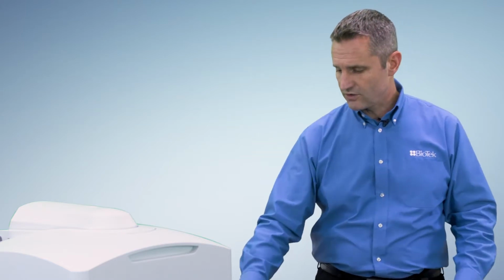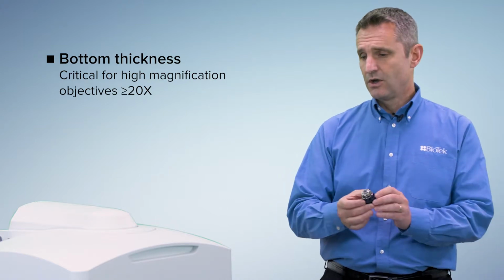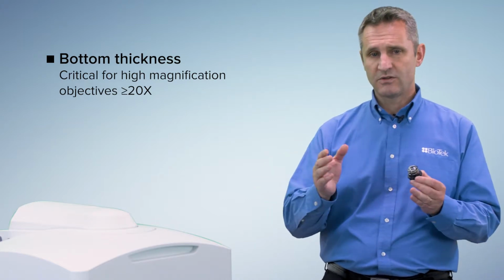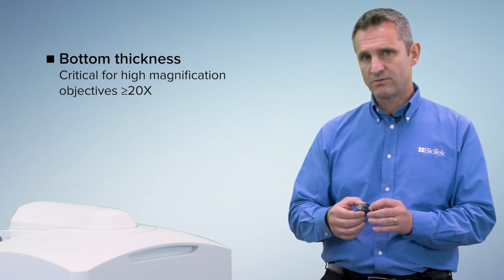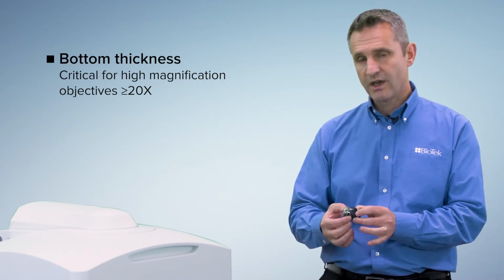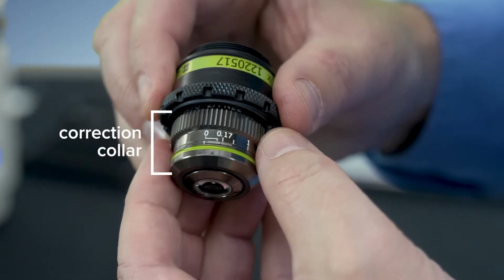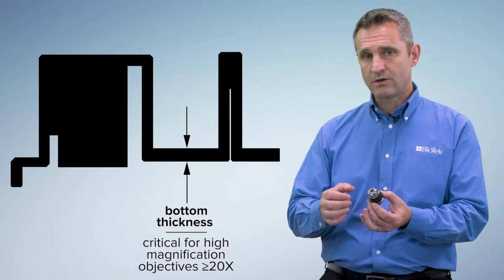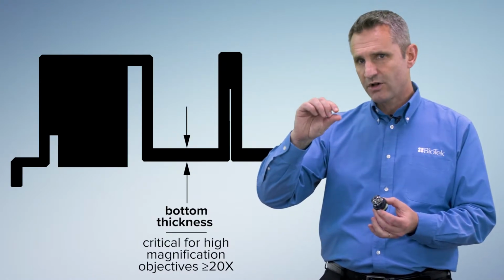Now, there is another parameter that is important as well, but is only important for high magnification imaging, which on our systems means 20x and higher. On these high magnification objectives, you will see that we have a correction collar. This correction collar allows you to correct for optical aberrations that relate to the thickness of the bottom of the vessel you're imaging through.